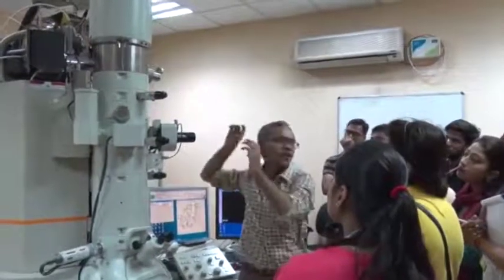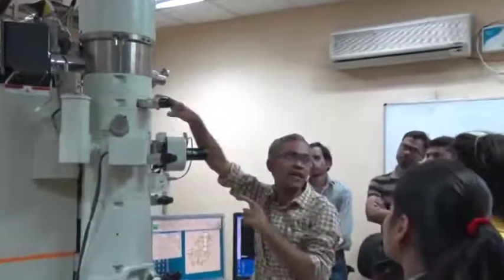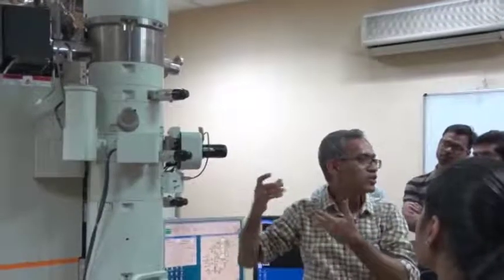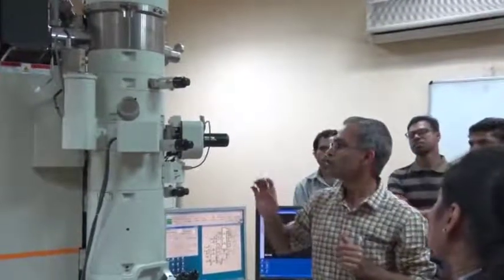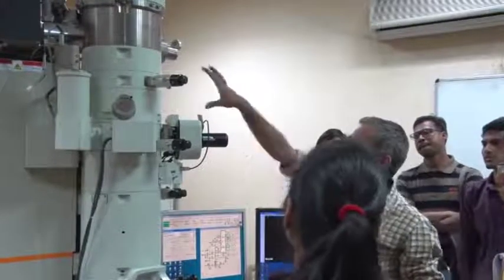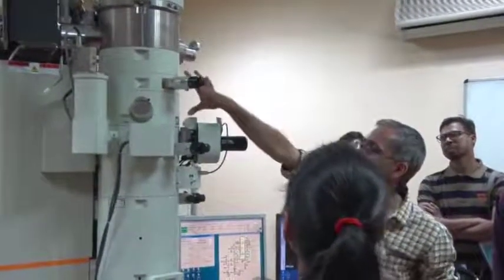How to center any aperture? Here is one knob and here is another knob. So you will do these alignments, or at least I will do, and you will have a look. Now it's okay. So this is about the condenser lens part.